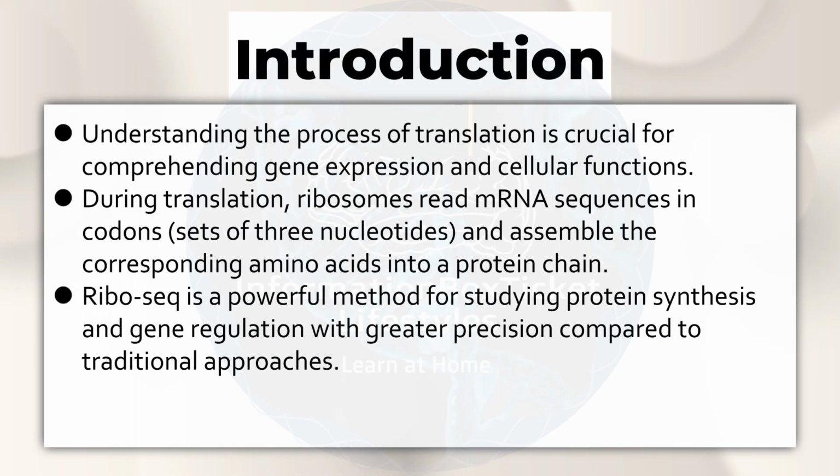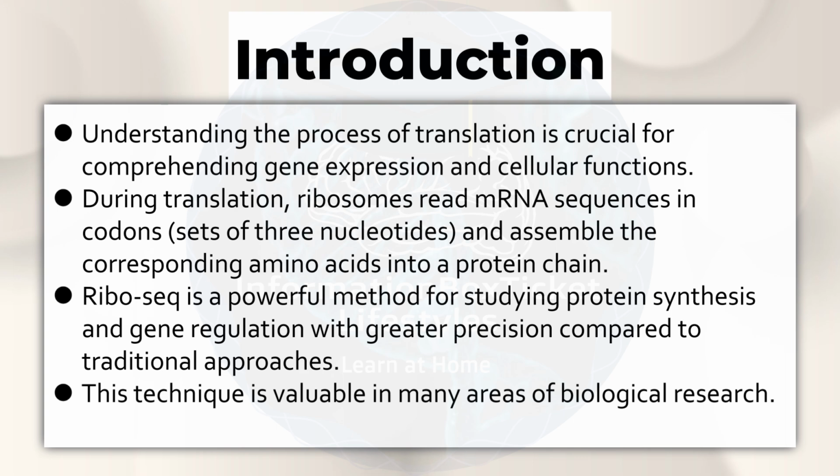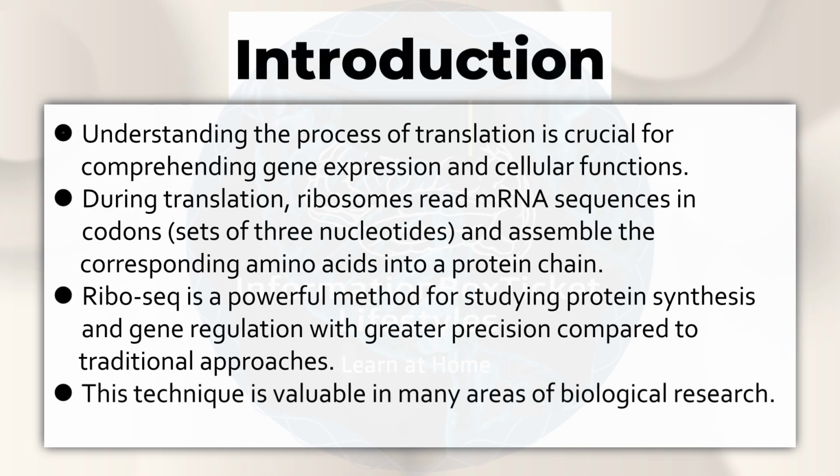Ribosome sequencing is a powerful method for studying protein synthesis and gene regulation with greater precision compared to traditional approaches. This technique is valuable in many areas of biological research.